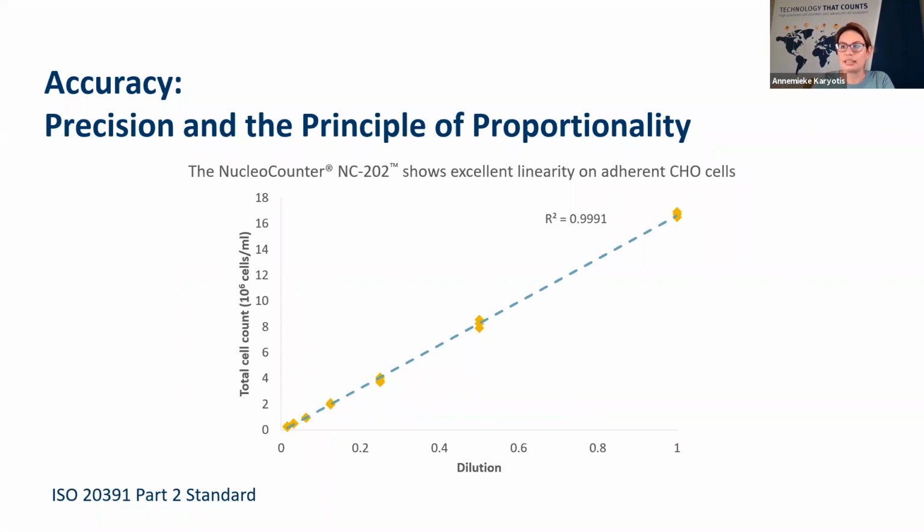And the other thing that I just want to point out, that although we've got excellent linearity here, and you can, in many experiments where you get excellent linearity, it's really important to keep a really good eye on the precision. So your percent CVs of each data point. And we have seen examples where you have good linearity, but the CVs are not acceptable. And I think you'll know who I'm talking about if you're listening.